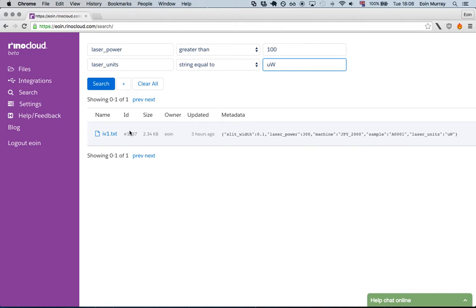And over a long period of time, it really gives you a lot of power for your data, with the notes and the sharing features and the metadata all really allowing you to add a lot of context and insight to your data instead of just having flat files with numbers inside them.